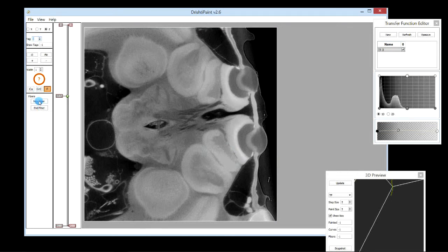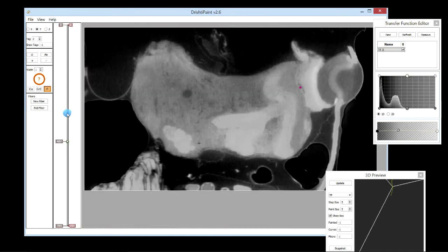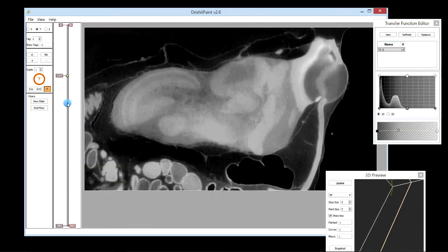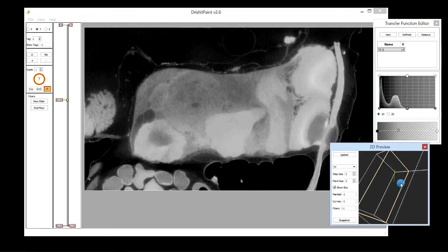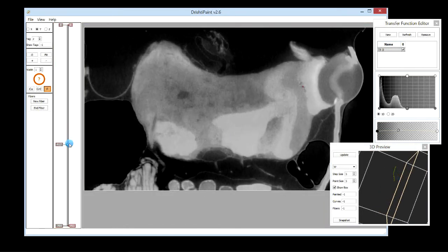Say another tag, new fiber. So from here goes there, possibly goes here. We might try a different angle. You just have to locate that track. So green one. Oh, it's way beyond. It's way down here. This is one here.